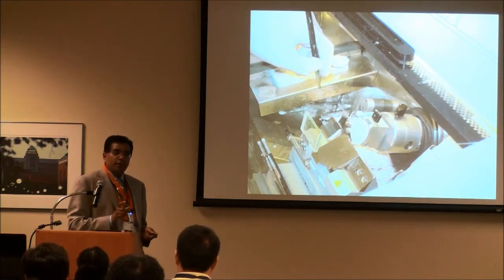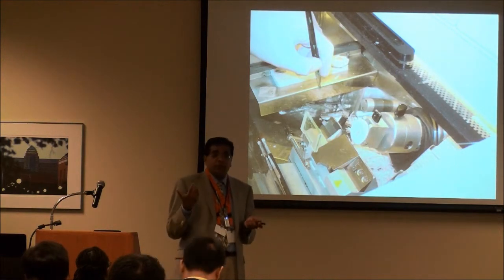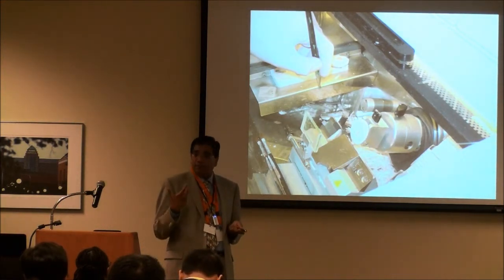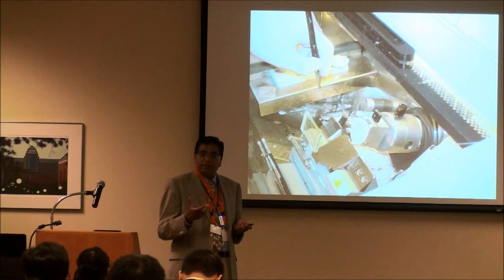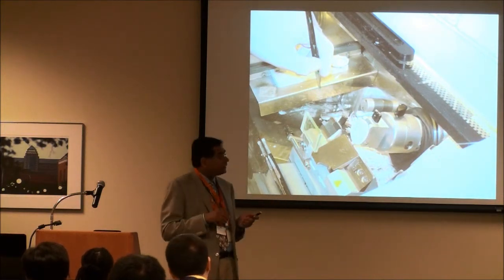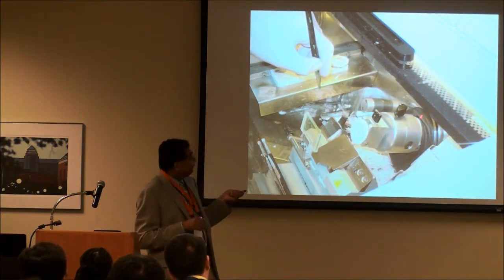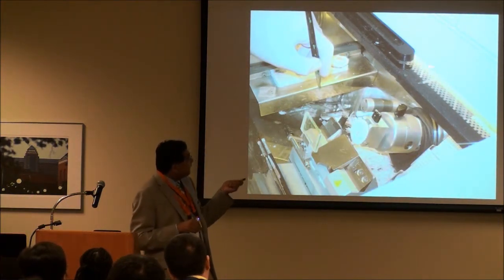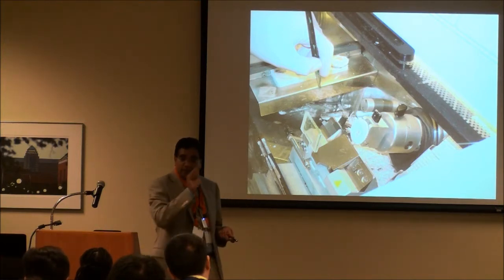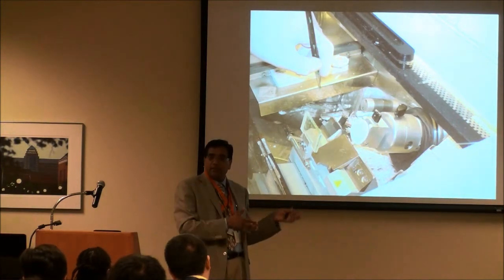Especially if the technician is high risk because of a lower immune system or is currently pregnant, we tell them to wear a mask and then do this procedure. After the procedure is done, if we suspect it was an infectious etiology, we decontaminate the cryostat. There is a decontamination process on the cryostat. We press the button. It takes a while, and that's how it gets decontaminated for the next case.